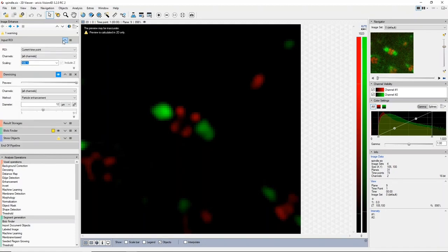Whereas with all these filters, the operation runs through blocks of 3D voxels. The slight downside of this is that it can be a little bit slower, certainly to get a result on the screen when you're running the operation, but it brings us some tremendous advantages in terms of the quality of the result that you can get in most cases.